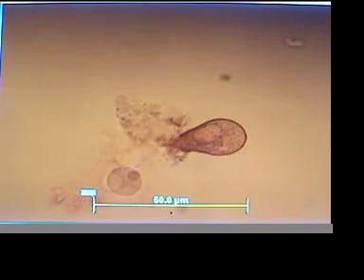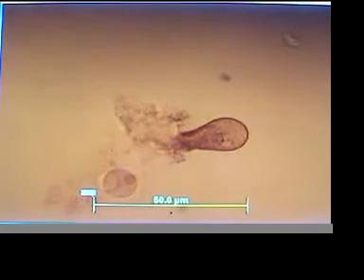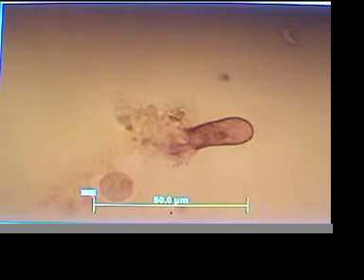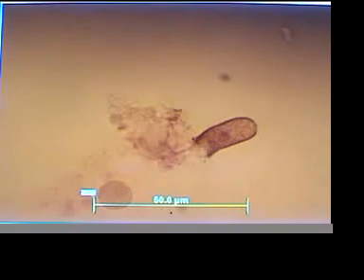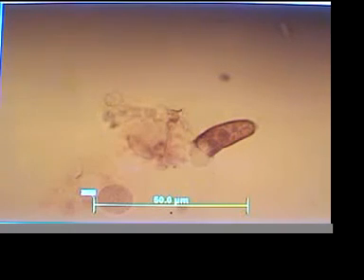We're going to just continue to watch this devitalization. This is a very interesting one. Look at that, dramatic. And it's continuing to change shape. I'm not going to touch it. I'm going to let it do what it's going to do. Look at that. Incredible. Seems to come in sort of little waves. Look at the very teeny tiny organism down here. I don't know if you can see it. Fascinating.